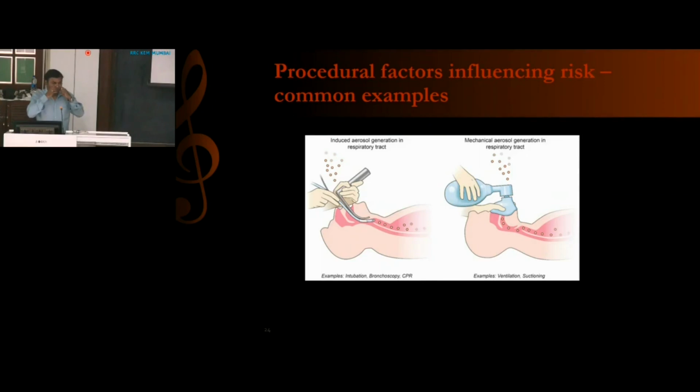You have to press the nose clip and you have to puff outside. There should be no air leakage. If there is air leakage, there is no use of that N95 respirator. You are going to inhale those aerosols anyway. And there is something known as air changes per hour.